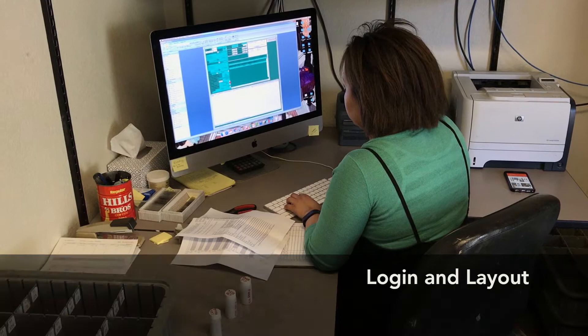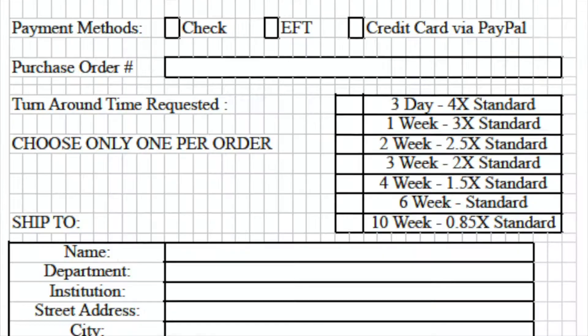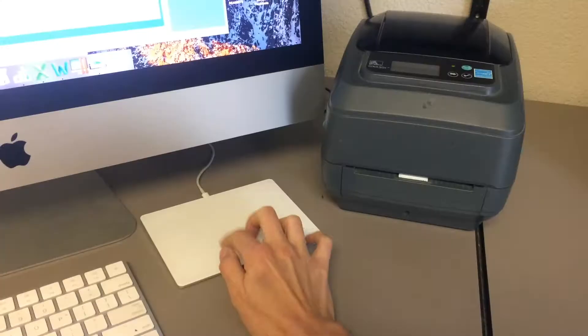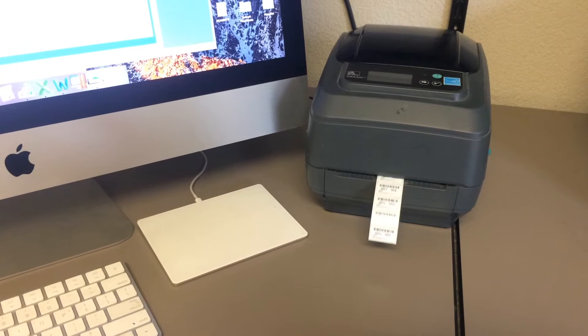When a new order arrives at Spectrum, all paperwork is reviewed and the order information is logged into our database. Special preparations, turnaround times, and customer contact information are noted. Each sample is then laid out in a numbered bin, corresponding rock labels are printed, and the order is assigned to a skilled technician. Then it's off to the lab.